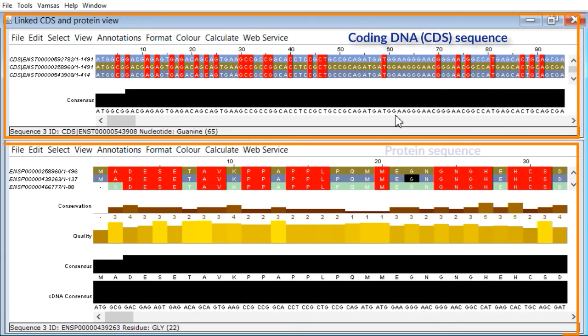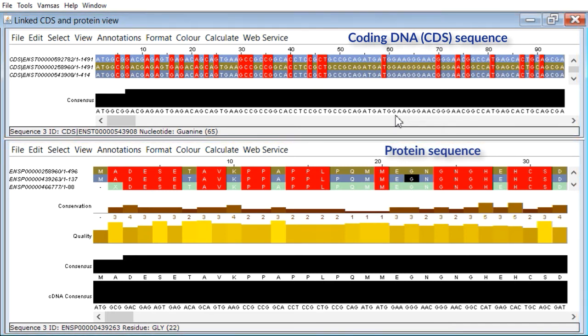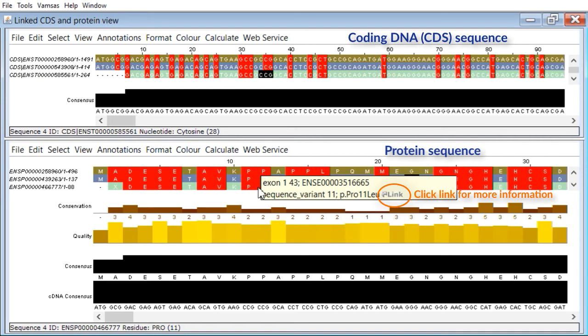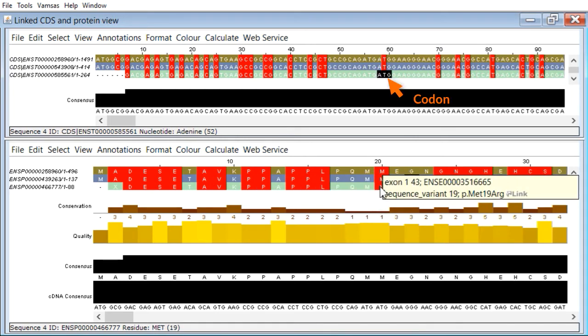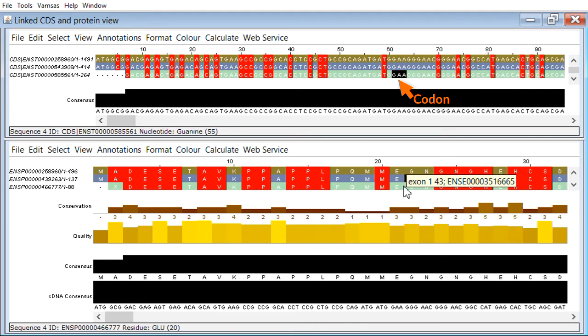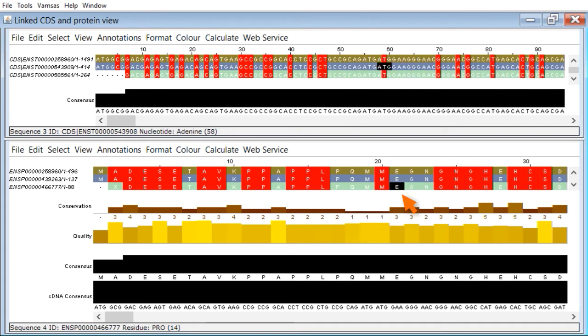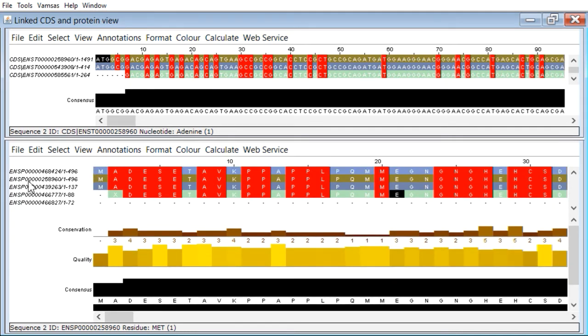At the bottom here we've got the protein sequence and we see we're in exon 1. As we move through that you can see the codon change up here, and you see in parallel in the protein sequence maps of conservation and so on. Now this is quite a small window. I'm just going to stretch this one a bit.